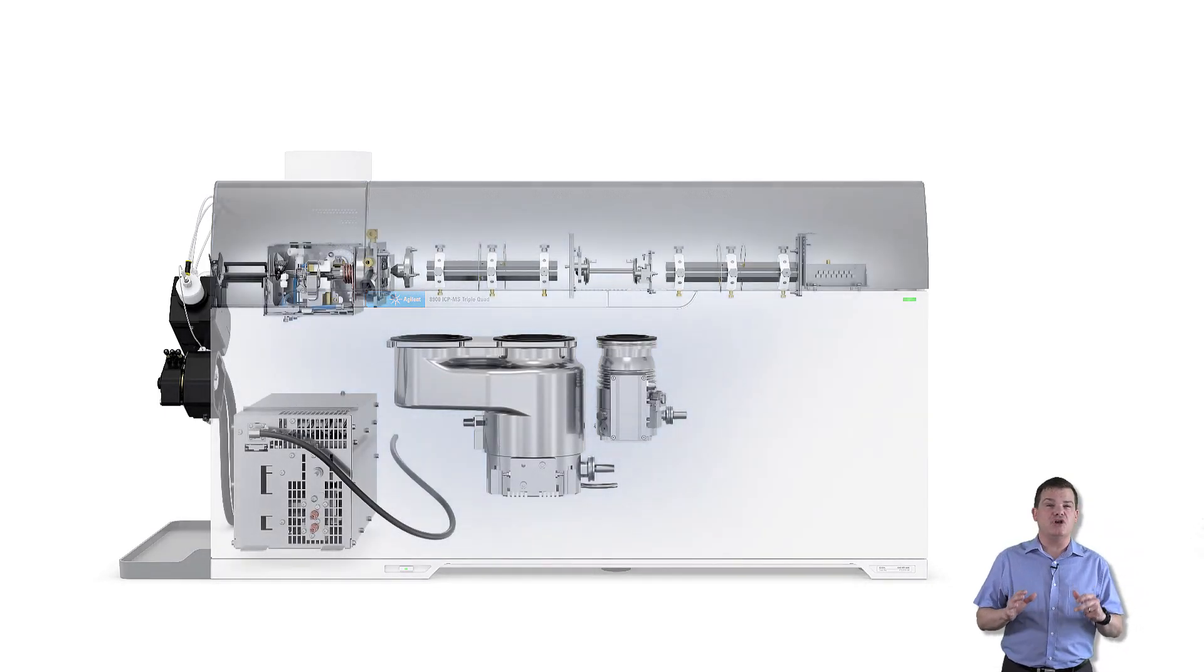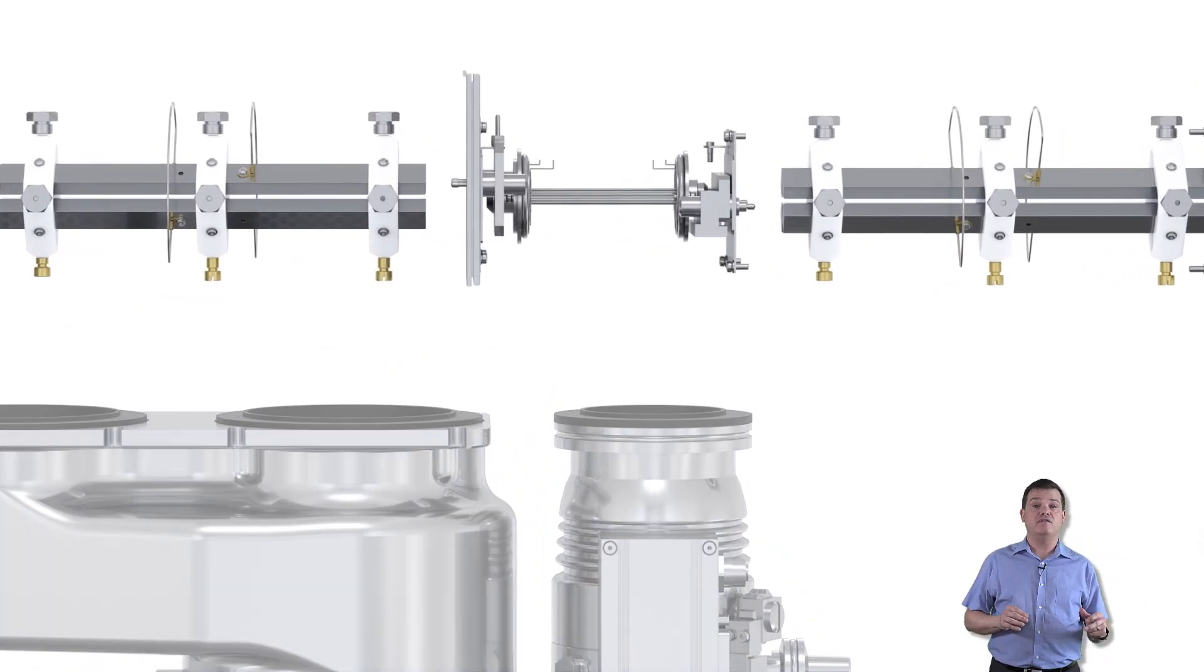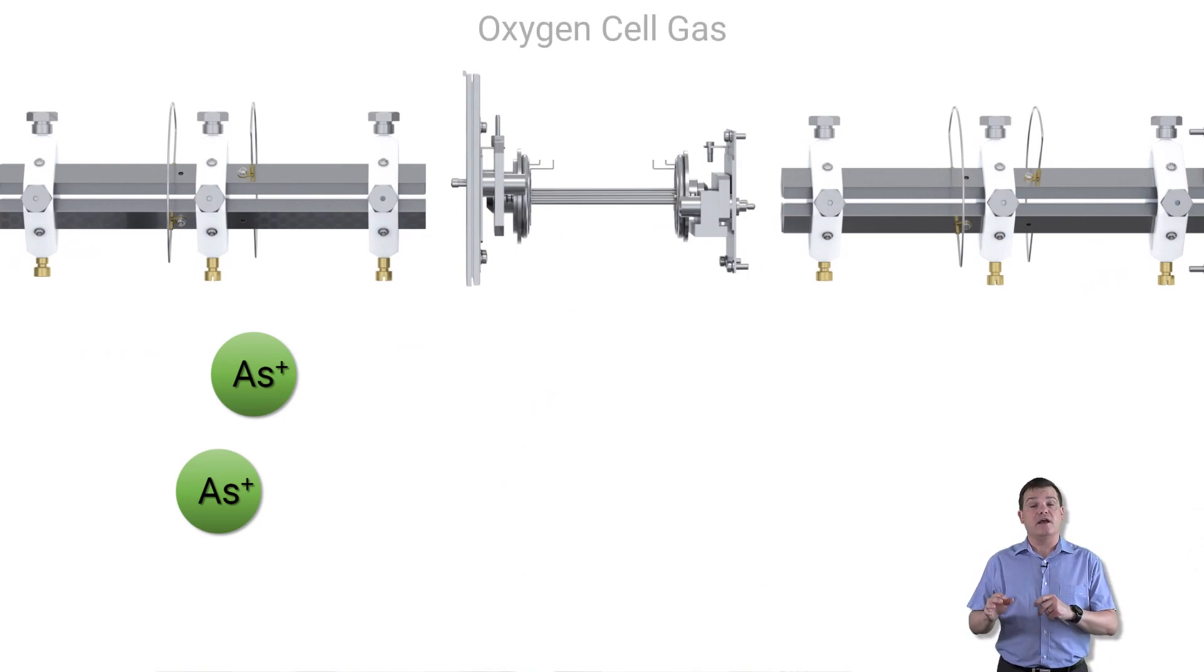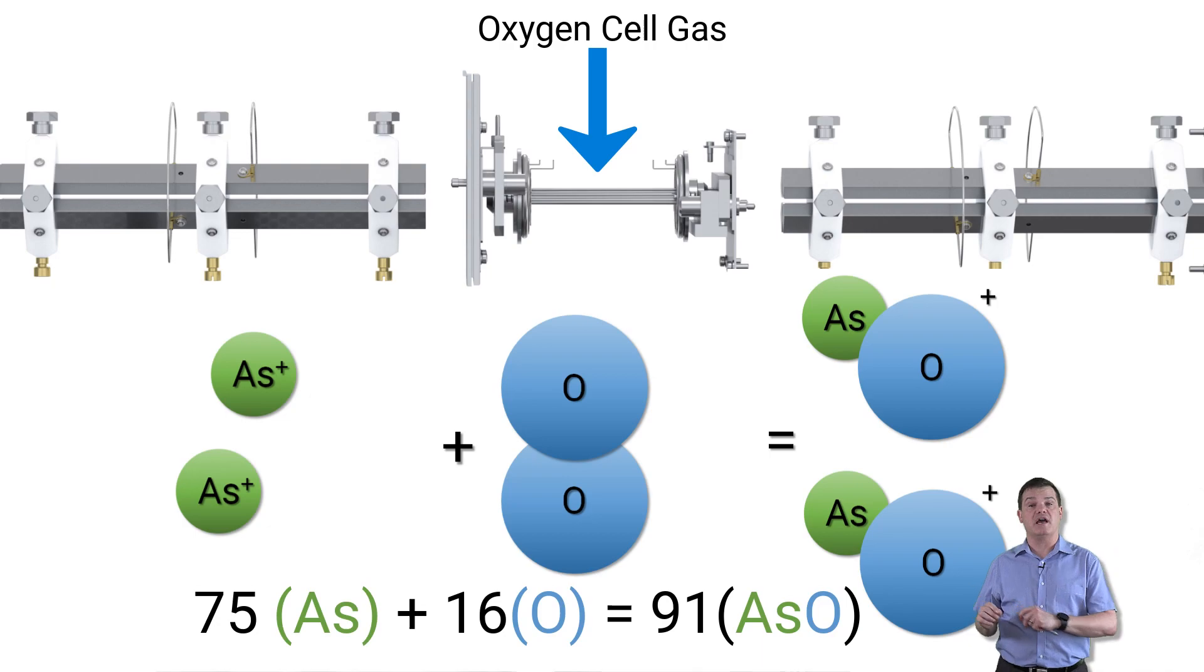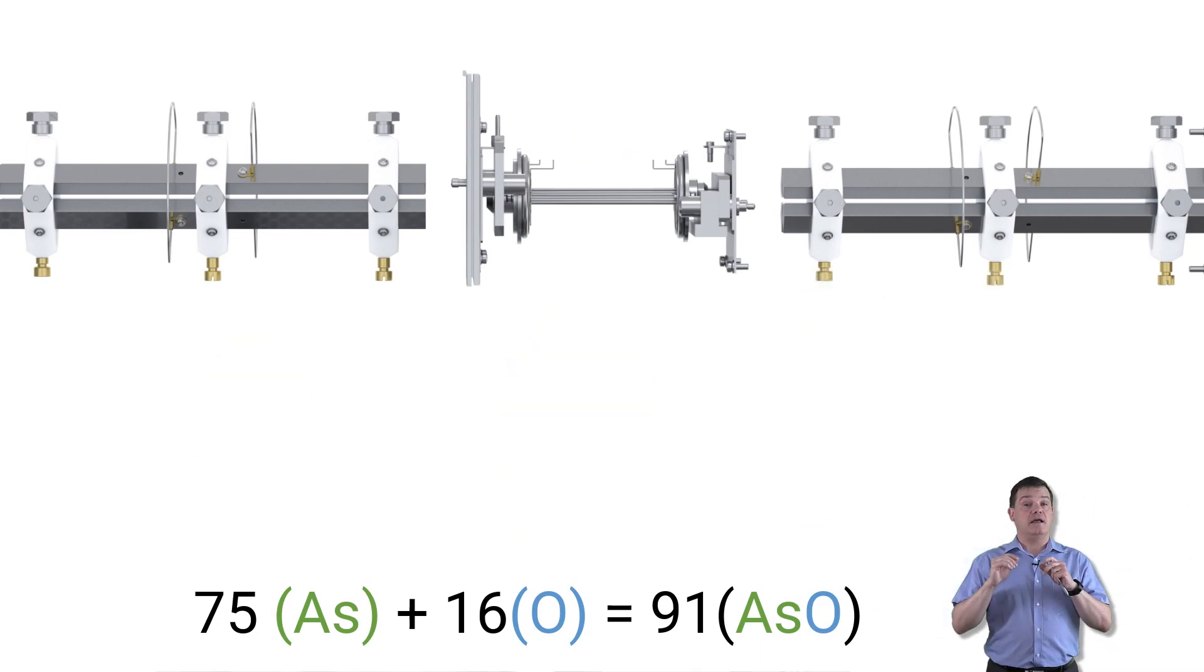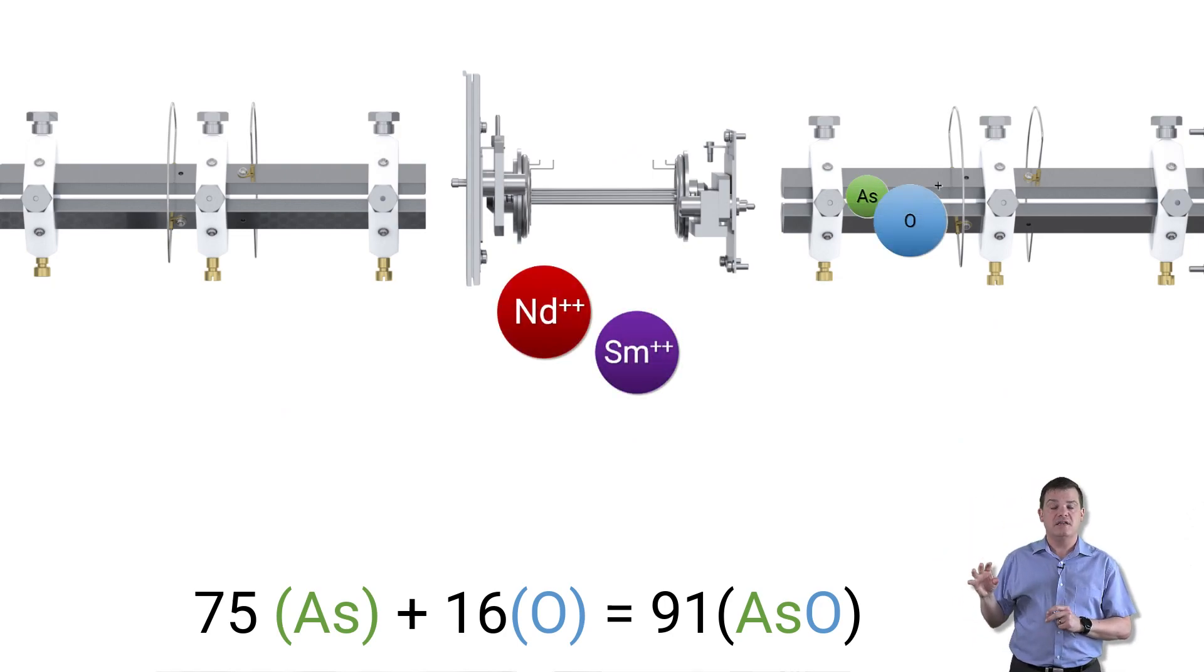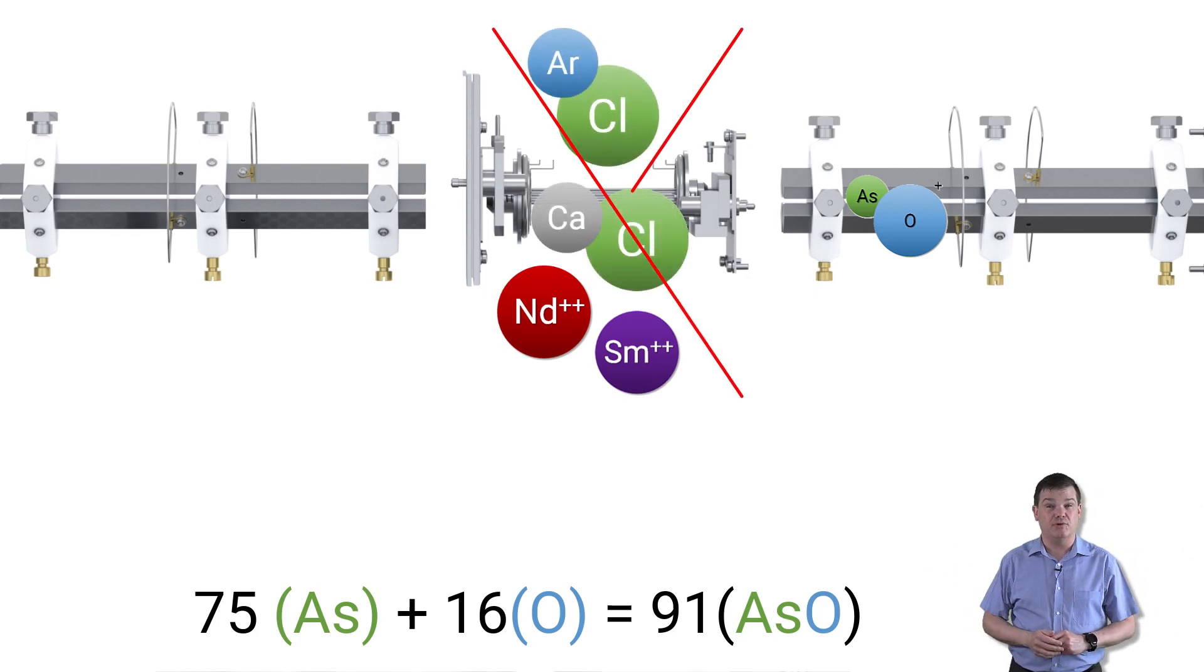ICP triple quad resolves the doubly charged ion overlaps on arsenic using oxygen cell gas to form arsenic oxide product ions in the cell. The beauty of this method is that it moves arsenic away from both the doubly charged ions and any polyatomic ion interferences such as argon chloride and calcium chloride. It's really that simple.